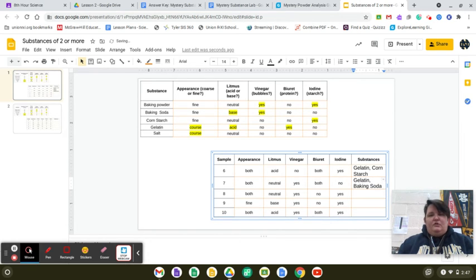Okay? So those are our two missing substances. All right. Number 8, again, exact same way. We start with protein. Okay? Protein right here. So it says no. Since it says no, our other one said both, so we knew it had gelatin. Well, this time it says no, so we know that it does not have gelatin, okay? Absolutely no gelatin. So then we go on to litmus.